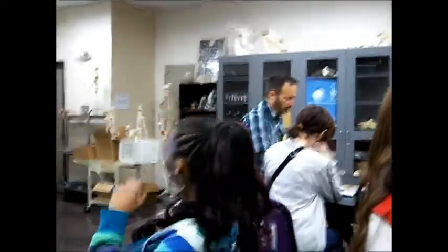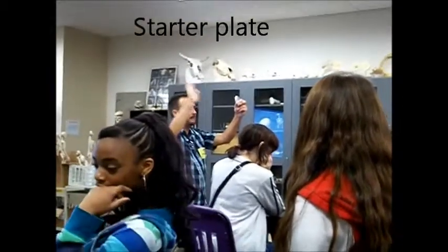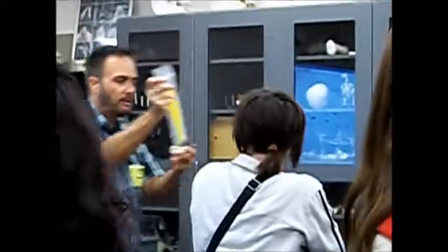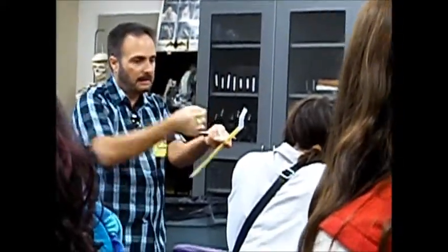Then you're going to get some bacteria, and this is what we'll kind of help you with a little bit. You've got a starter plate here. This has just regular old plain bacteria with no special DNA at all. You're going to take these loops, and you realize the tip of this loop is sterile, right? So you don't want to touch this. You're just going to pull it out by the end, take a little bacteria, stick it in the tube, and squish it like that and get it all off into that transformation solution. Then you'll throw this away.